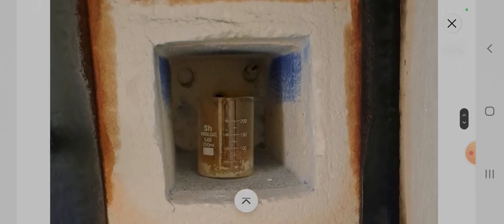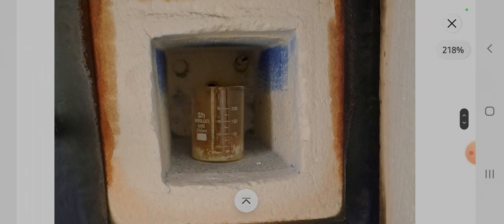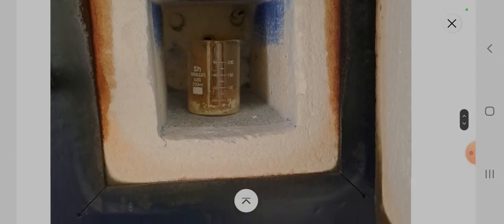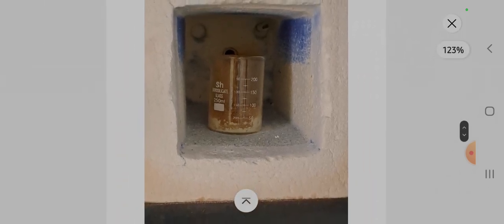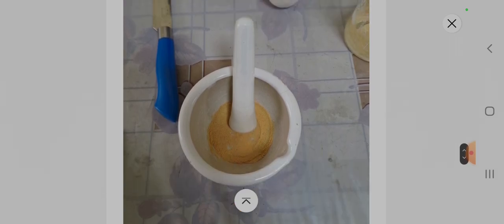And if we bring this beaker to the room temperature suddenly, then there is a chance of breaking of that beaker. So we take that beaker out and keep it for cooling naturally to the room temperature. After cooling the container, the material is collected from the container and mixed well using a mortar and pestle. Then here we can observe in this picture how aluminum nitrate solution is combusted and forms aluminum oxide powders, and this is collected in a mortar and pestle, and it is ground slowly. It is mixed well using a mortar and pestle.